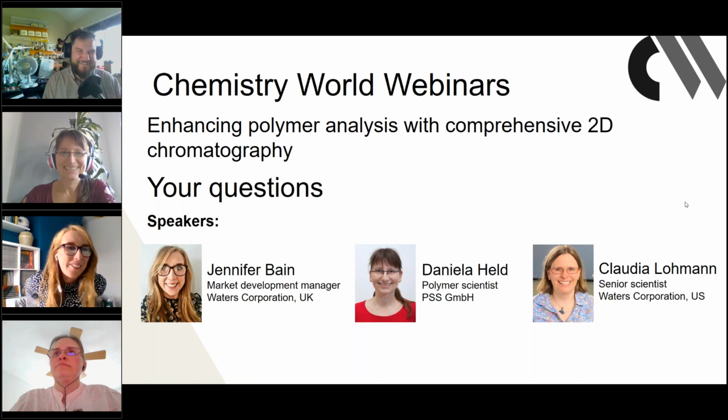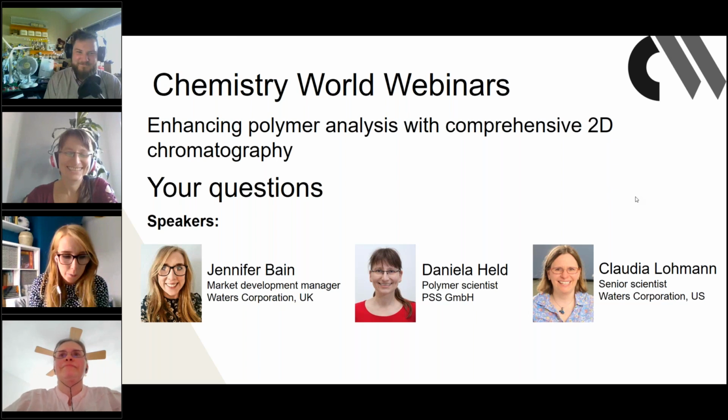Helps if I try again. So detectors. Our APC stack comes with ELSD detection, UV, and PDA and RI as standard, like most GPC or LC systems. For 2D chromatography, some of those aren't compatible.